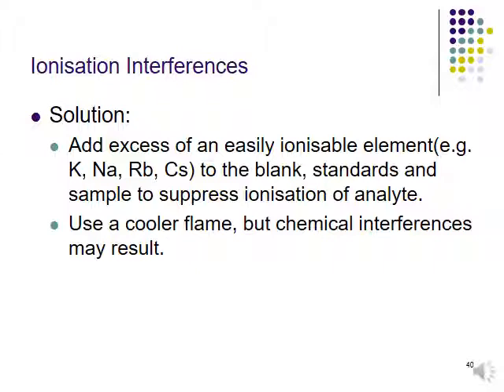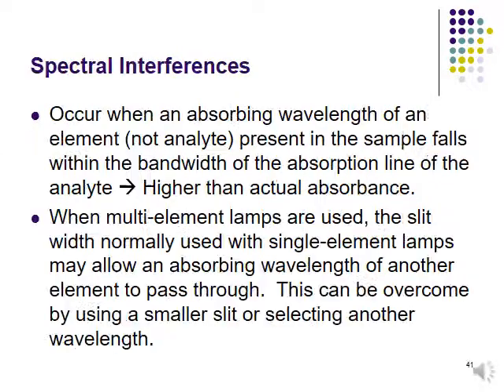By the time you make the temperature lower, it will invite the chemical interference. So you need to choose wisely what is the solution for your problem.